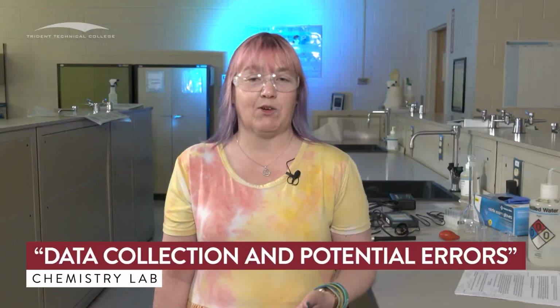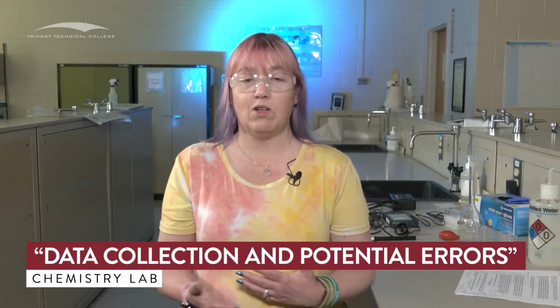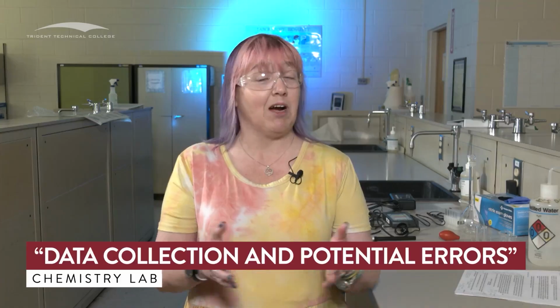Okay, thanks. So we're going to be talking about data collection and potential errors, and we're going to be talking about this in general. It's going to apply to all of our labs, so this is the same conversation you're going to hear for every lab. But I need you to pay attention to the same things and learn to apply them for each of the experiments. When we talk about data collection, there are certain pieces of data that you're going to be asked to collect. Depending on which lab it is, that's going to determine which pieces of data you're going to be asked to collect. It's not going to be the same every time.